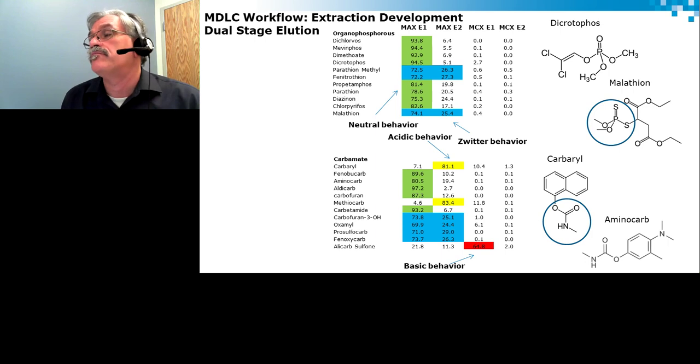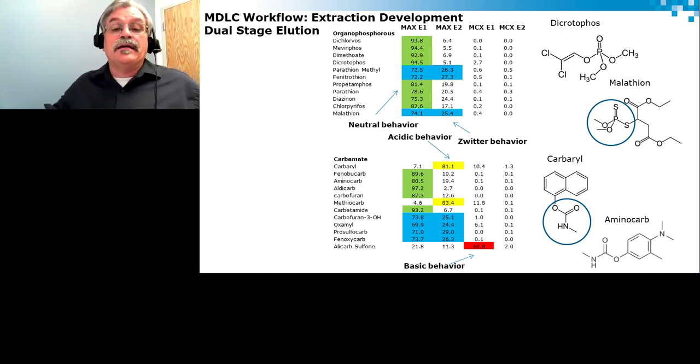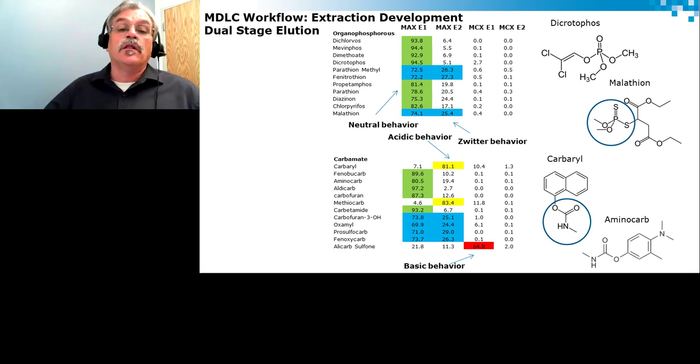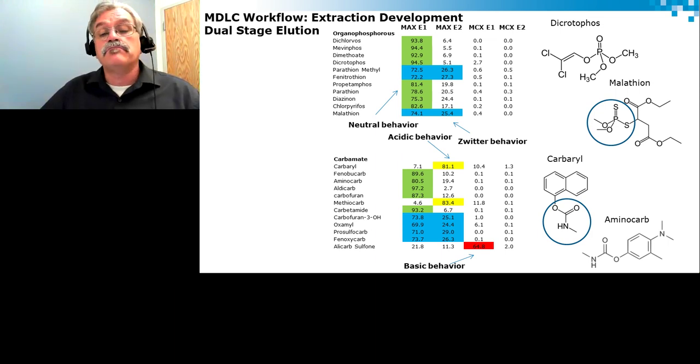It means it's not retained by reverse phase, and it's not retained by ion exchanger, but it's actually retained by the, a portion actually breaks through in this case. So it gives kind of a really good idea of what multi-D can actually do. It actually gives us a lot more information about the behavior and the physical and chemical properties of our target analyte.